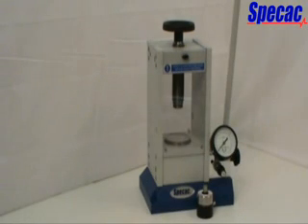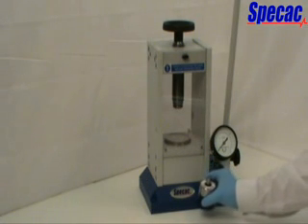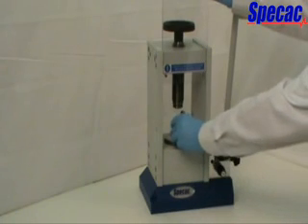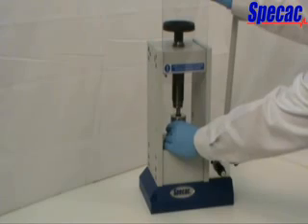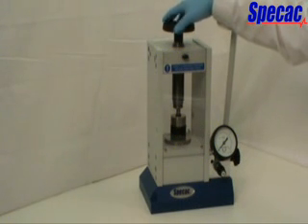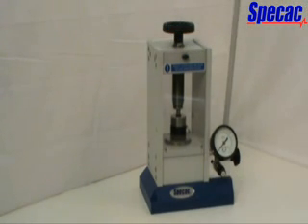For a typical pressing of a sample, we are using the 13mm die assembly as an example of work to press. Raise the front safety guard and place the die to be pressed on the lower bolster pressing face covering the piston. Ensure that the work is positioned centrally and lower the safety guard. Screw down the top bolster pressing face attached to the lead screw assembly by turning the lead screw handle clockwise until the parts to be pressed have come into contact with each other.